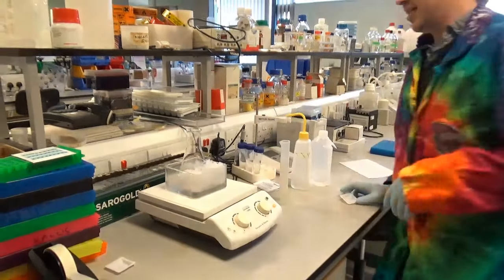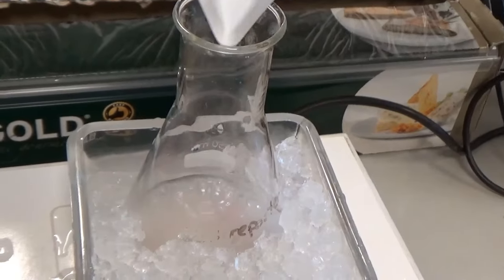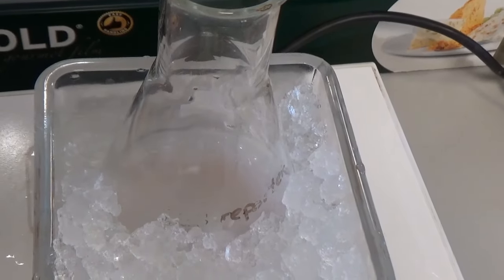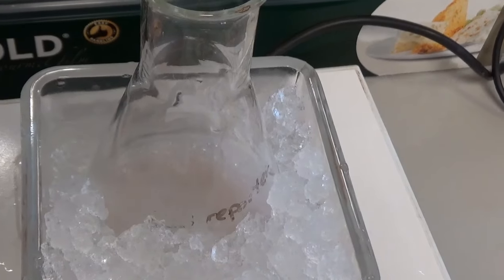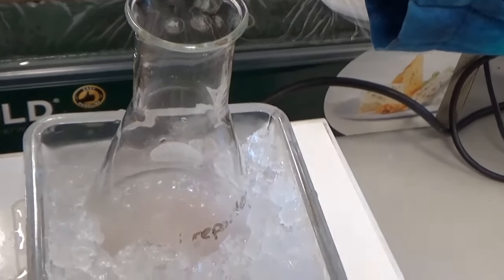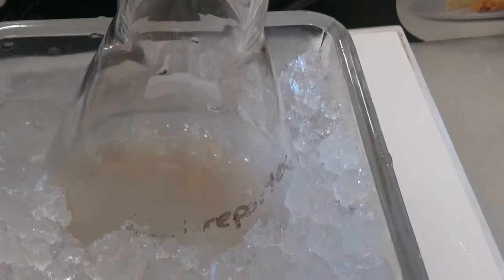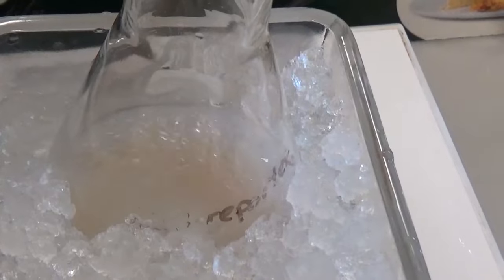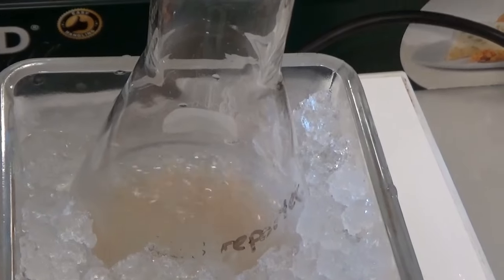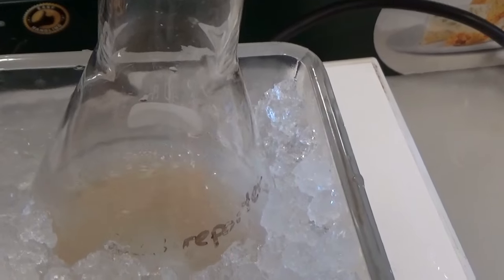Basically add it to that, and if you have a look at the top, it's called sodium nitrite. It will turn one of the amine groups in there into diazo functionality, which is basically two nitrogens attached to each other. Over time, and I'm just adding a bit of acid, it just speeds the reaction up, you will start to see it change colour. So that orangey colour indicates that a diazo group is a charged group, which means that it reflects light of a different wavelength. So the colour change is indicative that I've got that diazo functionality.